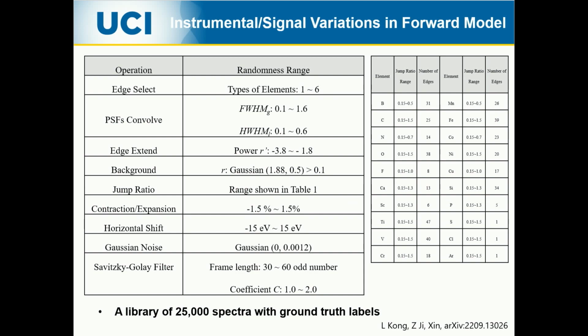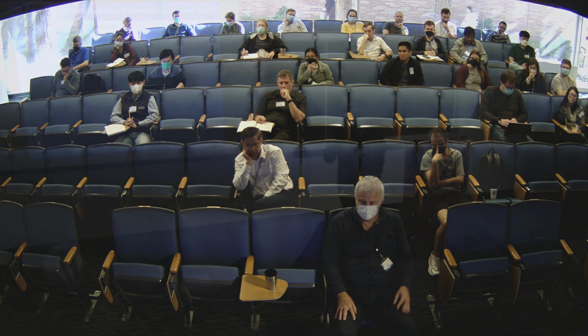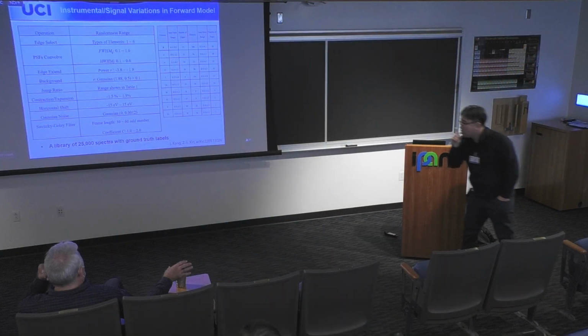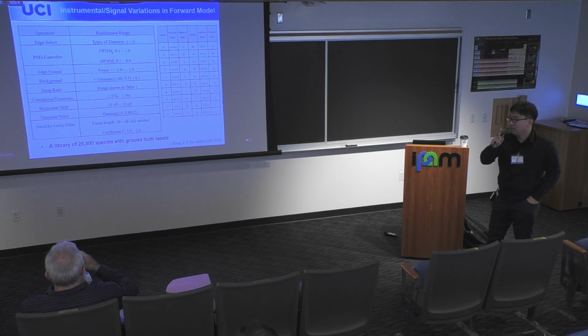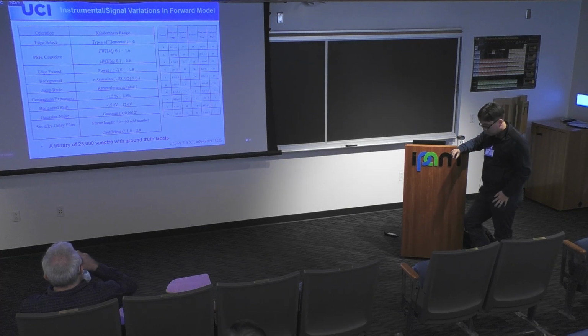Very nice. Just one question. Why are you using Gaussian instead of Poisson noise for the counts? Well, this is a really important thing for EELS. In most cases, let's talk about DQE, unless you are using the new DDD.